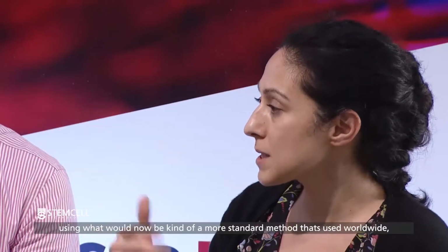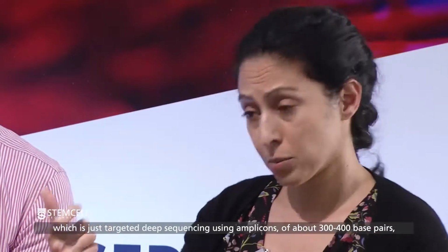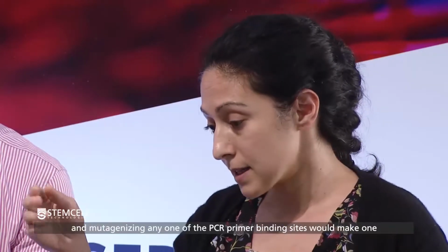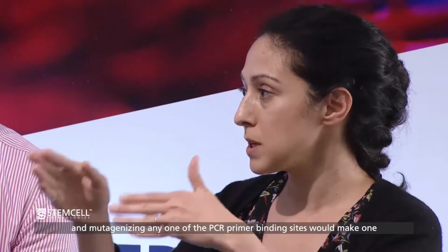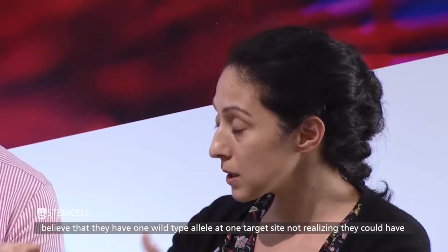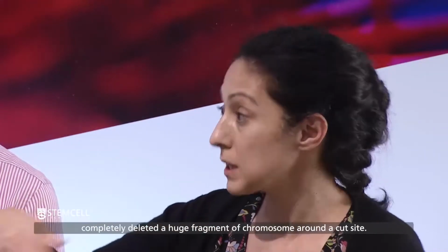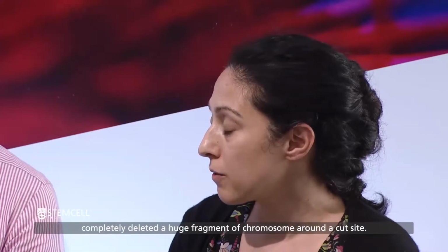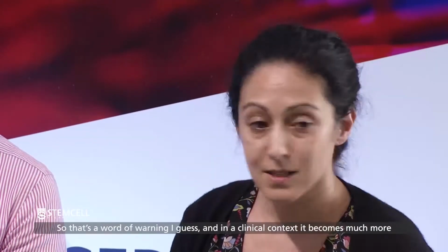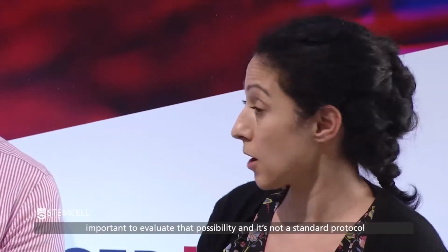using what would now be a more standard method that's used worldwide, which is just targeted deep sequencing using amplicons of about 300 to 400 base pairs. Mutagenizing any one of the PCR primer binding sites would make one believe that they have a wild type allele at that on-target site, not realizing that they might have completely deleted a huge fragment of a chromosome around the cut site. So that's a word of warning, I guess. And in a clinical context, it becomes much more important to evaluate that possibility. And it's not a standard protocol.